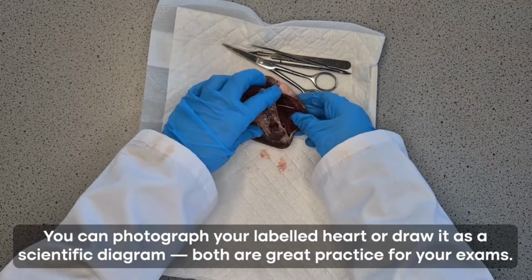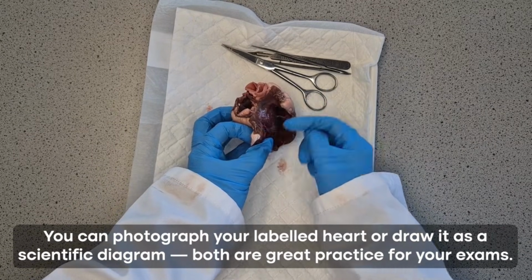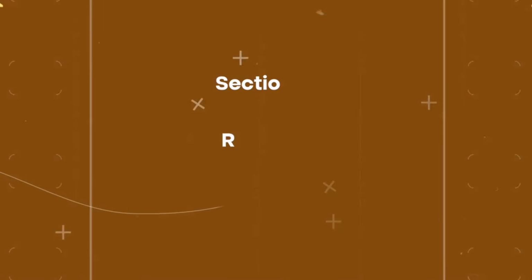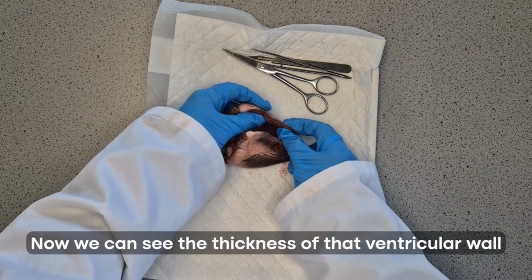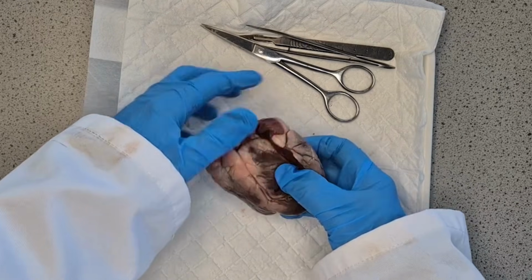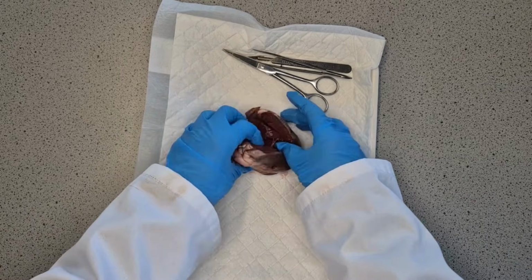Yeah, so we can see, again, we've gone through our atria, which I've actually completely cut now. That was, if we put it again round like that, the atrium. We can see the valve with those tendons. And now we can see the thickness of that ventricular wall. This is the right side of the heart. And we can see just how much thinner it is on the right compared to the left side of the heart. And the students can annotate this on their diagram.